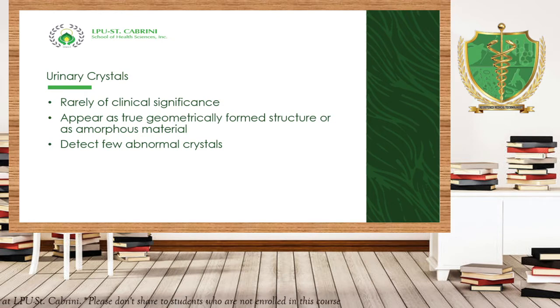But before I leave cast, take note guys that cast is considered as clinically significant. No? Clinically significant po ang presence ng cast sa urine. And the determination of cast in the urine should be done in a right manner. No? The intensity of light should not be too high in order for us to detect the presence of the cast.